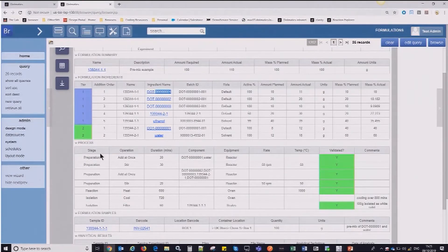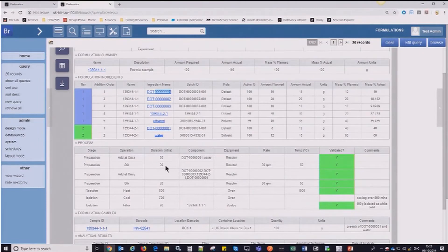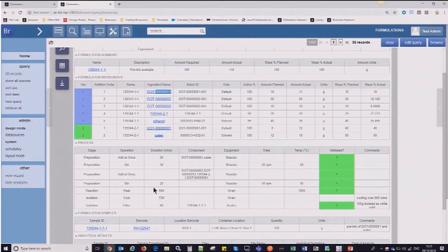Moving on to the process step, that's all captured here, and for those of you that are familiar with browser, you know that you can then search all of this information as well. So if you are interested in finding a formulation that has certain ingredients and has had particular process steps involved in the production of it, that can all be searched. I've got information here such as the various stages and operations that were performed on this formulation, the components that were used at each step, and some information about the equipment.